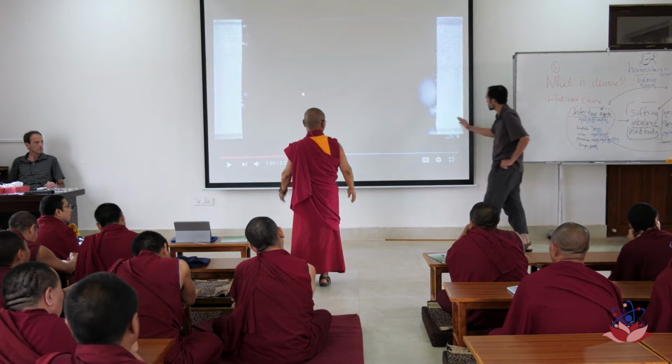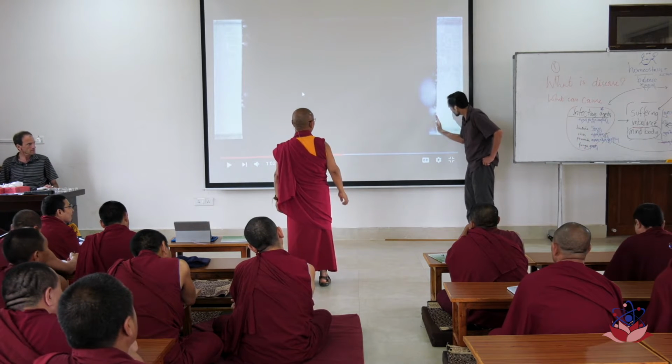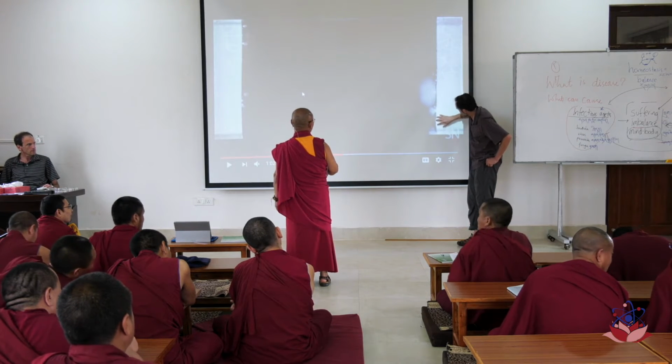Okay, so see, this sharp boundary, all of these bacteria are dying.